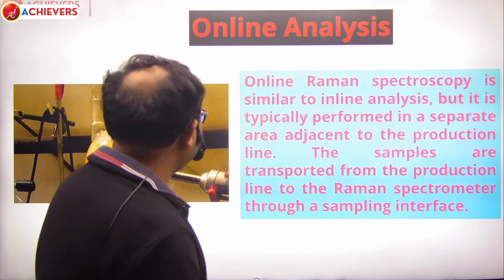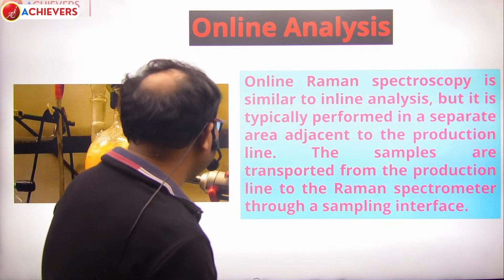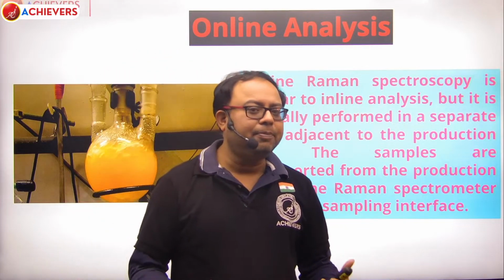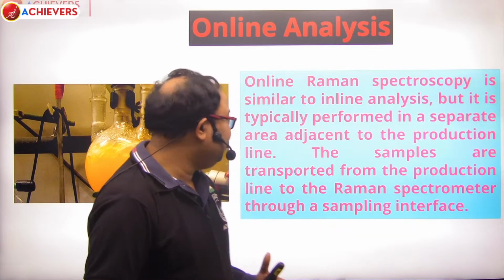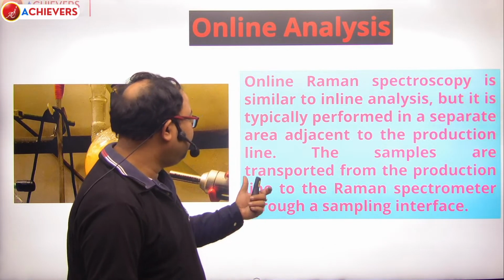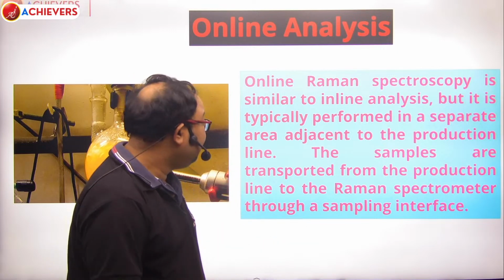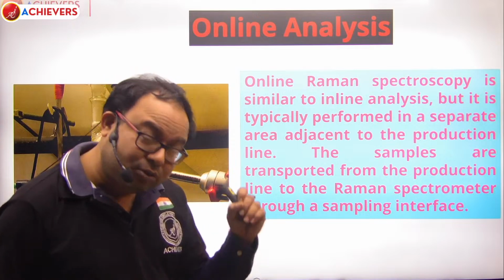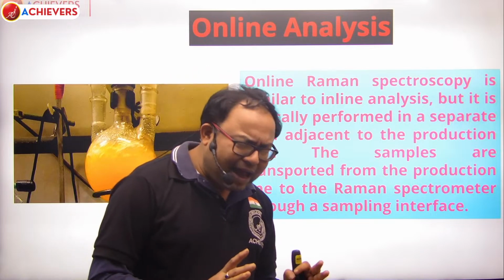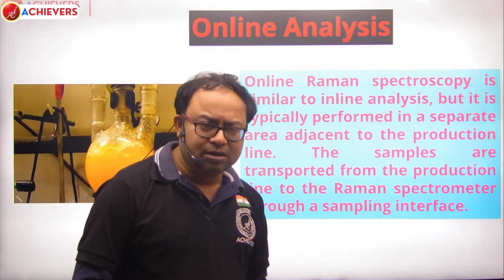Online Raman spectroscopy is similar to inline analysis, but it is typically performed in a separate area adjacent to the production line. It has to be adjacent to the production line. That means you don't have much of a technical difference, just some industrial adjustments.